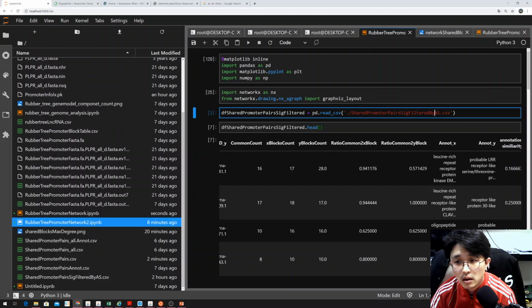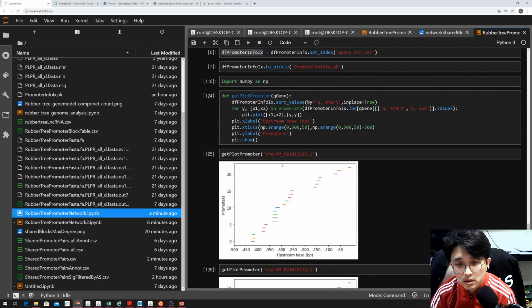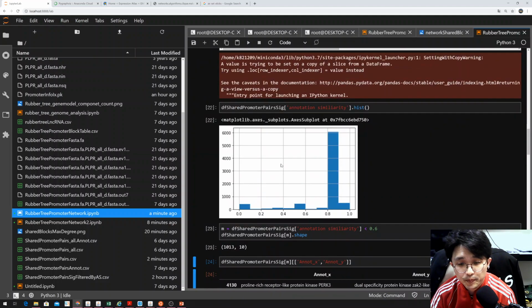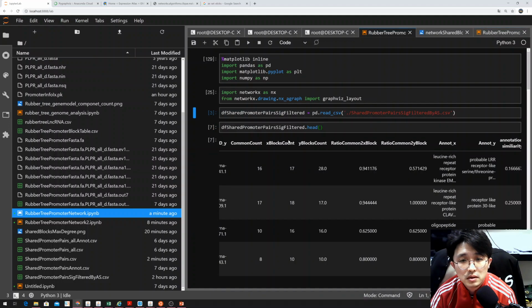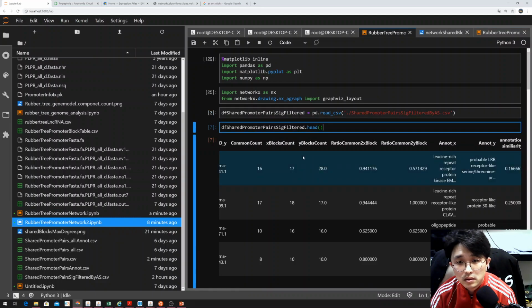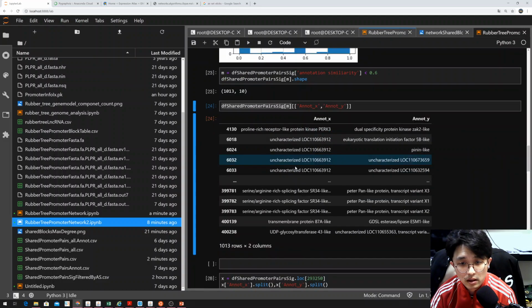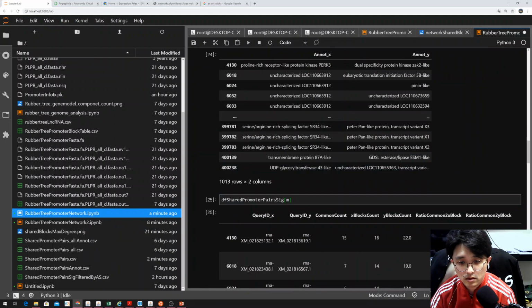Filtered by AS, but there is no filtered by AS, which means something was not saved before. Not good. Okay. So what is the filtered by AS? Like this. Then I will make that also like that. Okay. So this was the situation.